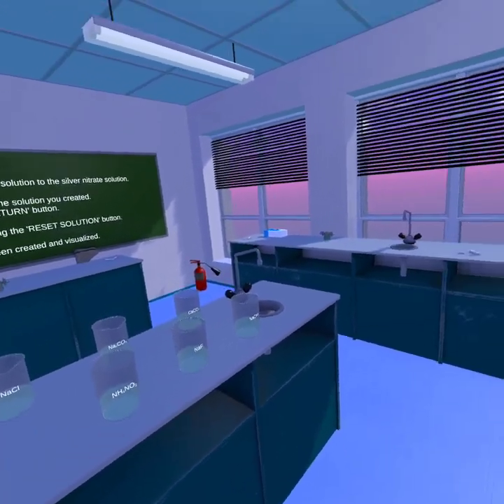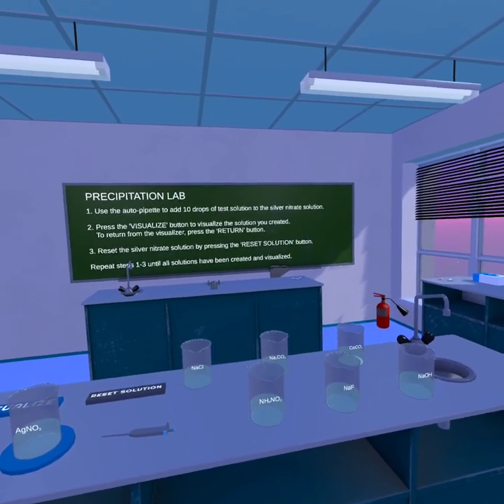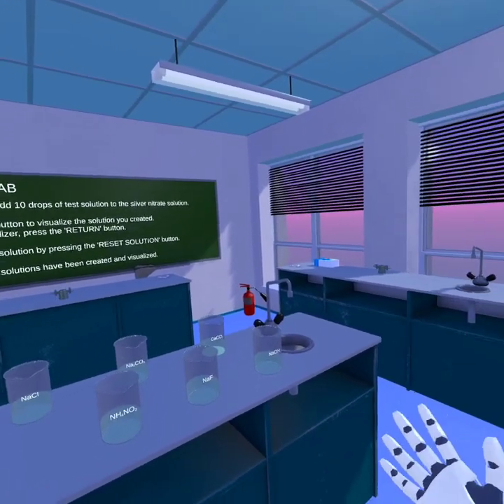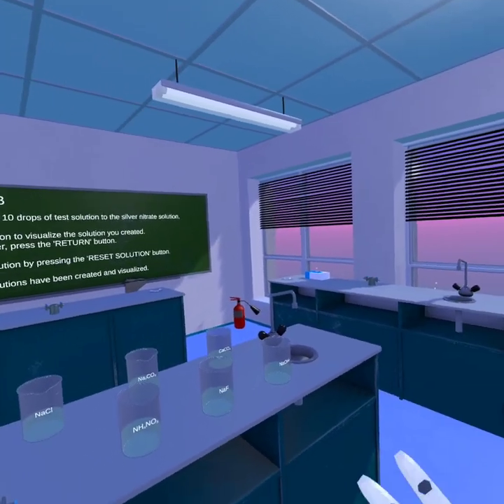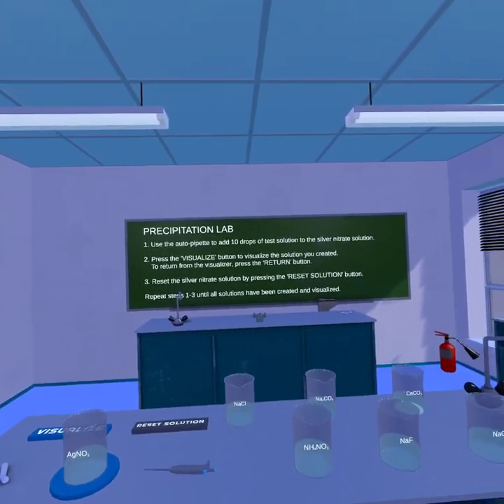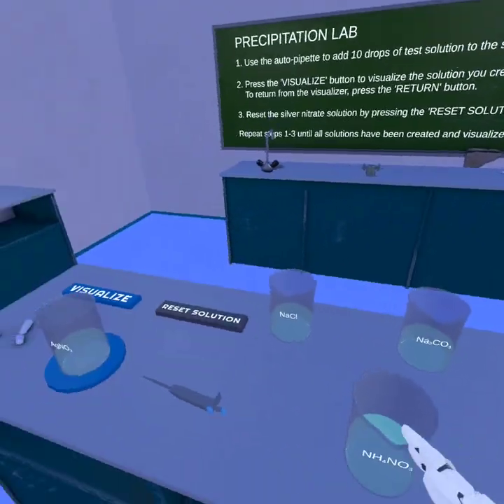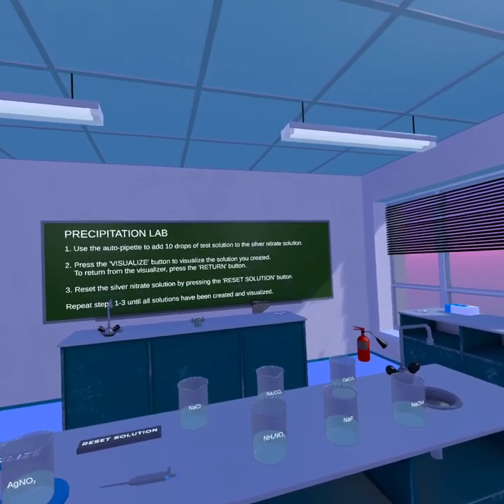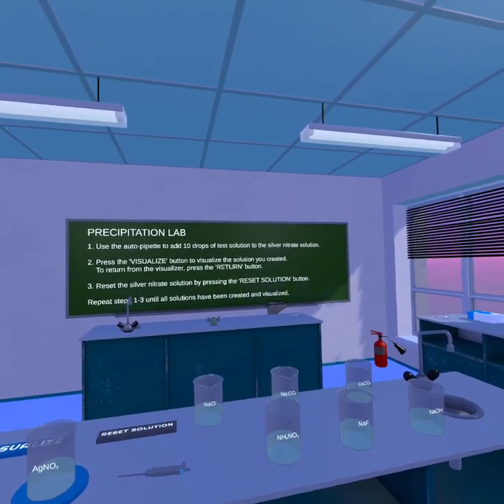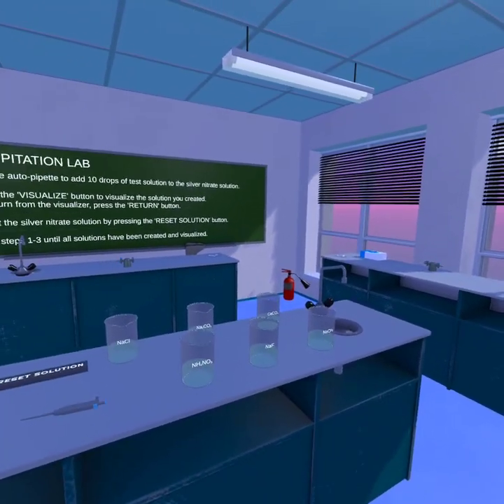As mentioned in all of my videos, our philosophy at VLab is to allow the student to explore and even pick things which are considered quote-unquote wrong. There's no real such thing as a wrong answer. It's just a new learning experience. If you picked, for example, NaF, and you added it to the water and then nothing happens, that's not just a wrong answer. You're learning that some things stay ions and they don't interact. It's still a learning experience.